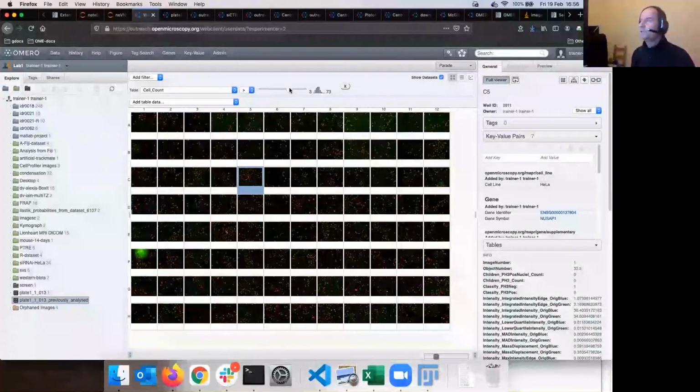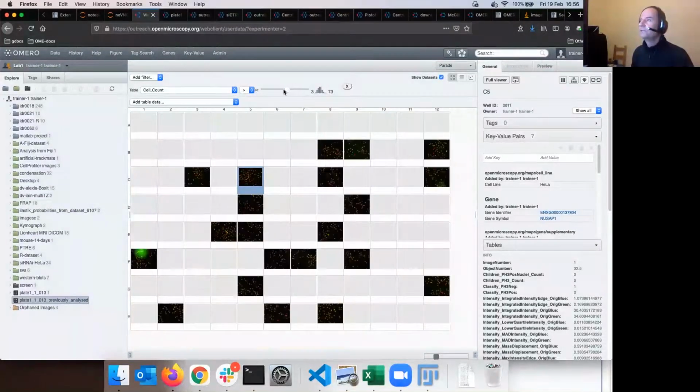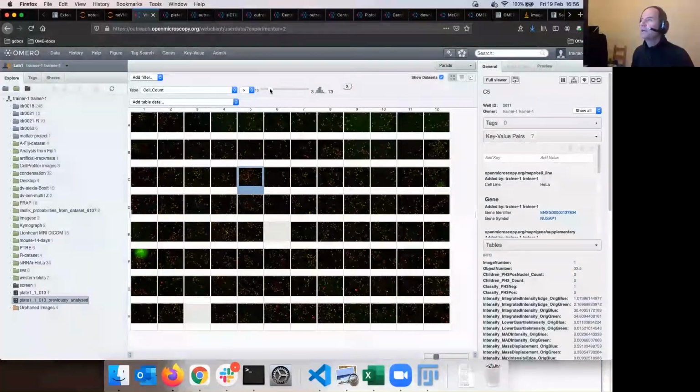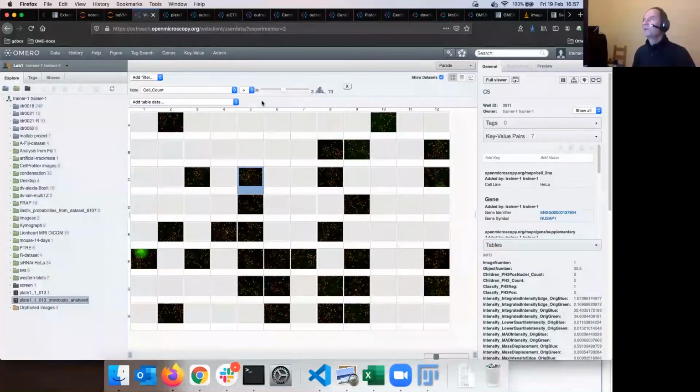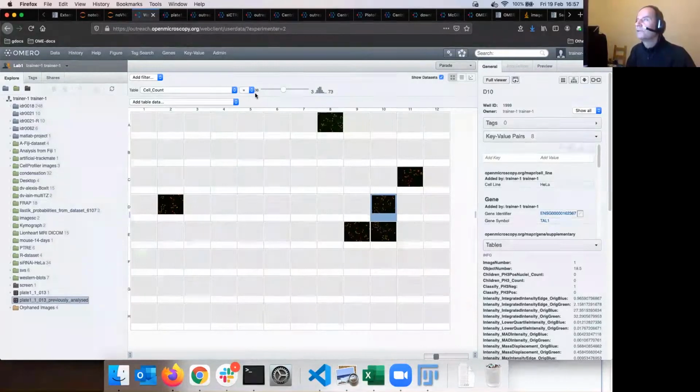So this cell count parameter is quite intuitive. And I'm basically showing now, if I start doing the first action, you will see that because the bigger than sign is in this direction, it will show only the wells which have, let's say, more than 29, pardon me, it will show only the wells which have more than 29 cells in them. Okay, so if I move the slider back and forth, you can see, yeah, to the left it shows more and more wells, because many wells have at least a couple of cells in them. Yeah, and I can go also equals, and if I select here, it should now equal 36. Okay, so only the wells which have exactly 36 cells are highlighted now.